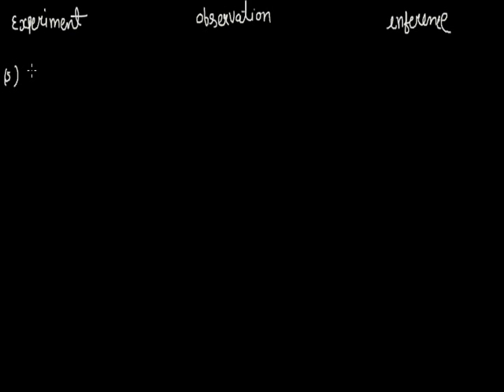If white PPT is not dissolved with hot water as well as in liquor ammonia, that is NH4OH, then it indicates that the salt does not contain Pb2+ and does not contain Ag+. So when we are taking a salt and adding dilute HCl, white PPT comes out, but if PPT is not dissolved in hot water, then we are adding the NH4OH solution.